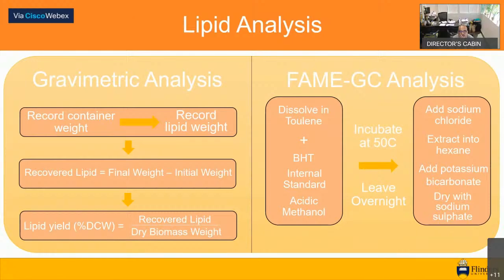The gas chromatograph gives an output displaying the varying amounts of each individual fatty acid relative to each other, and each is presented as a percentage of total fatty acids. In our lab, the Thraustochytrid cultures have been found to be highly versatile, producing a significant amount of omega-3 PUFAs and also a high amount of SFAs for application in both nutraceutical supplements and biofuel production.